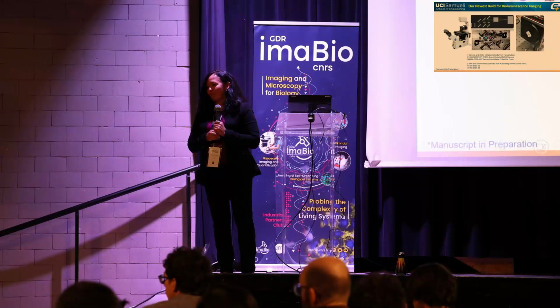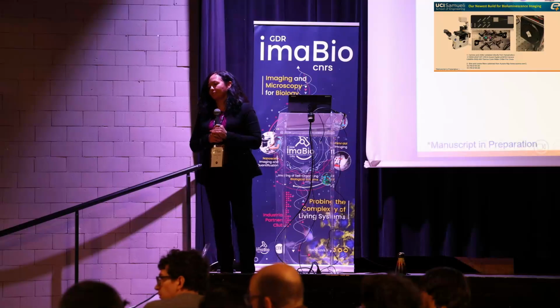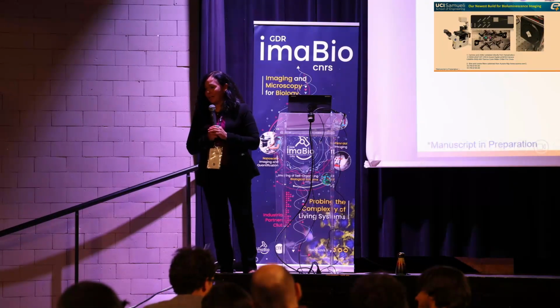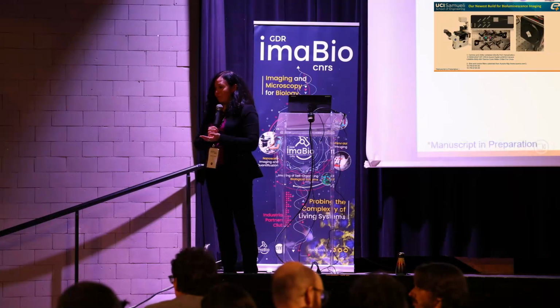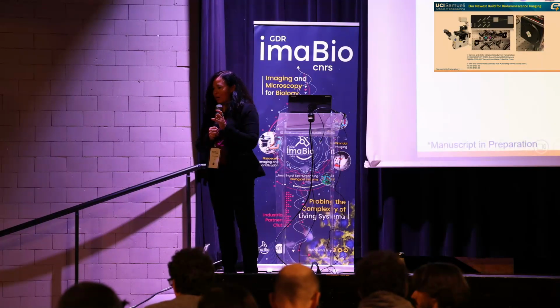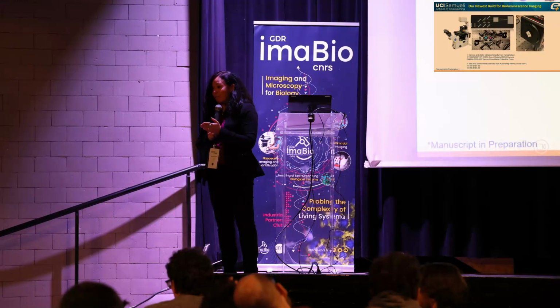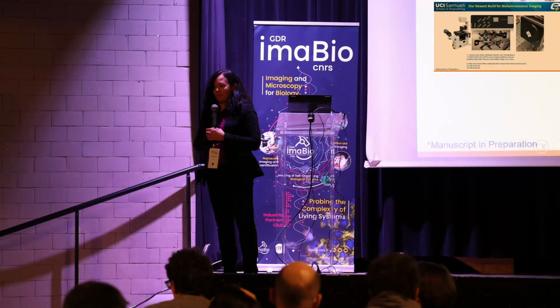My question was sort of related to the first one, which is, what about other biomolecules? So like FMN is pretty fluorescent. Does it have a distinctive lifetime? Yes, it does. Angelika Rück from Ulm does FMN imaging. And as far as I know, the lifetime is different, and the excitation is different as well. So you can use FMN as one of the markers for cancer cell states.